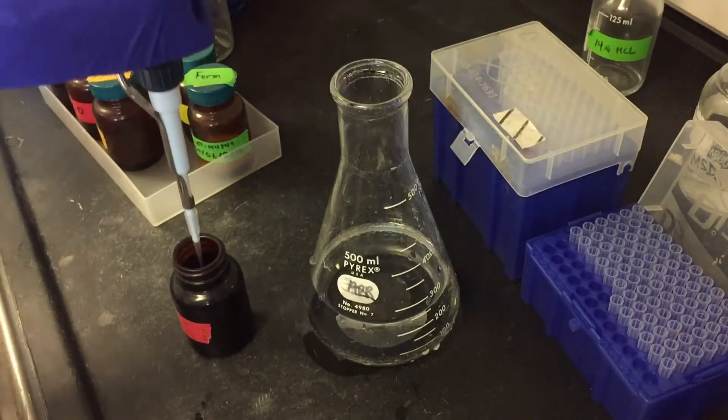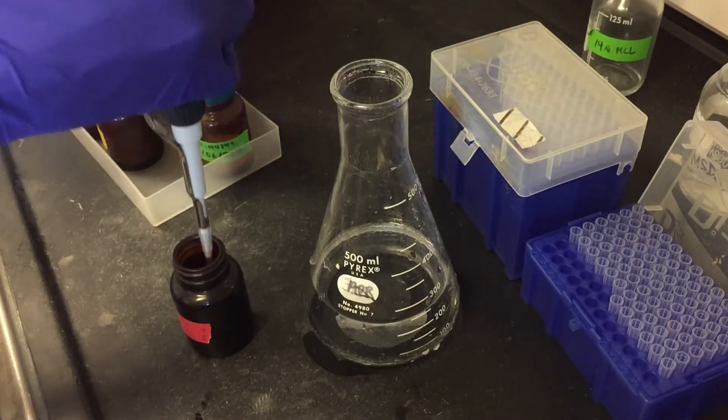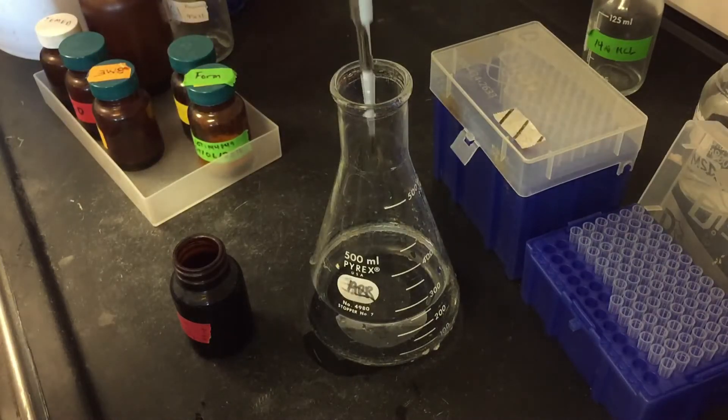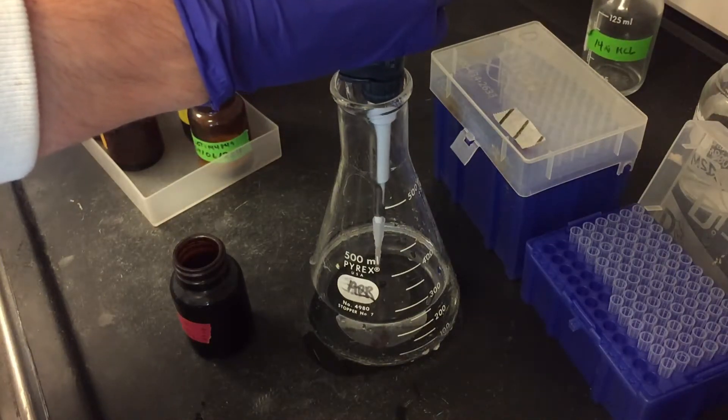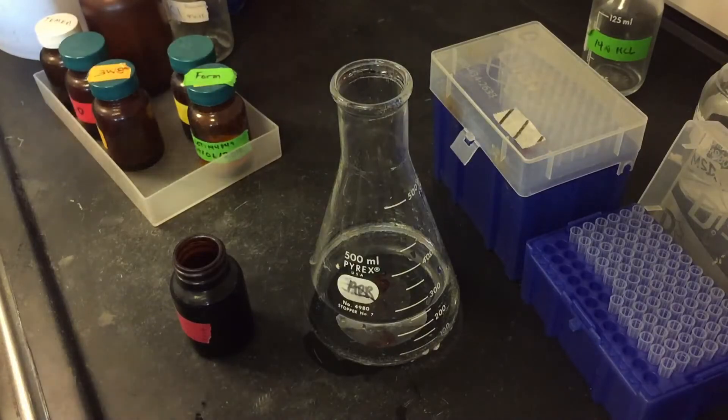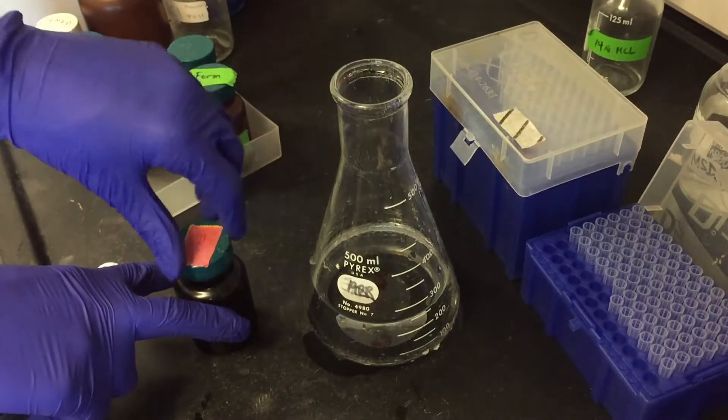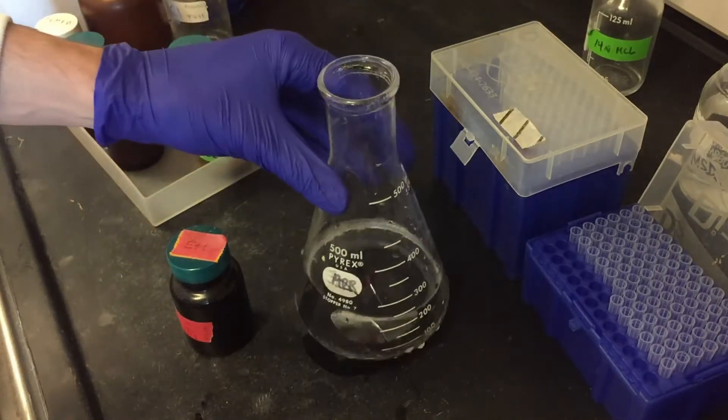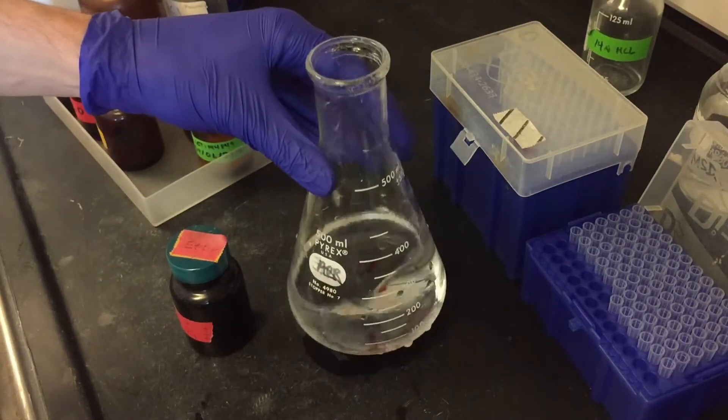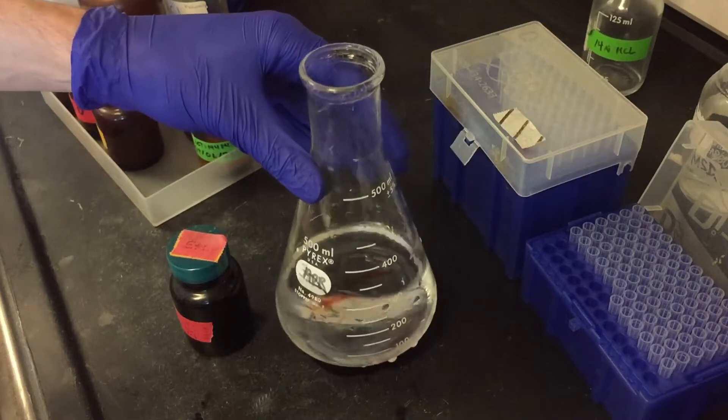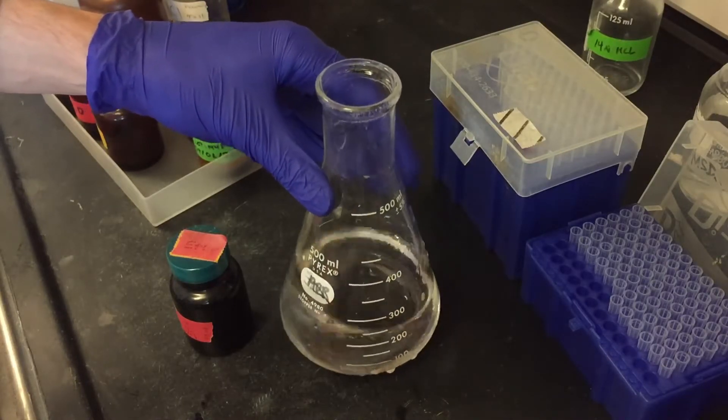Be careful when you're adding the ethidium bromide. As you can see it's really concentrated here and it is a carcinogenic intercalating agent meaning it binds to DNA, which is the reason we're using it. Another reason we're using it is because it's fluorescent under UV light which will allow us to visualize the PCR product in the gel.